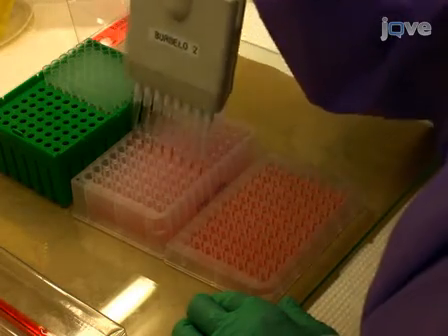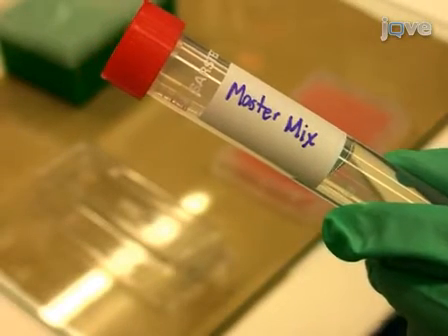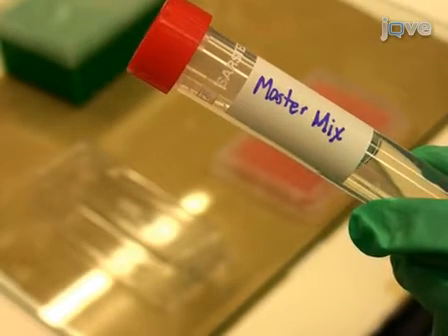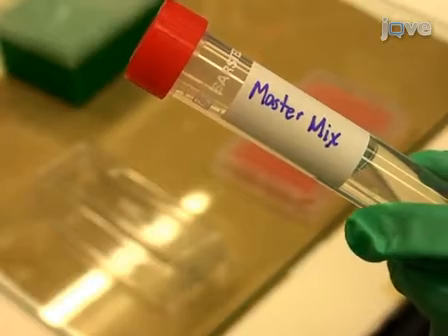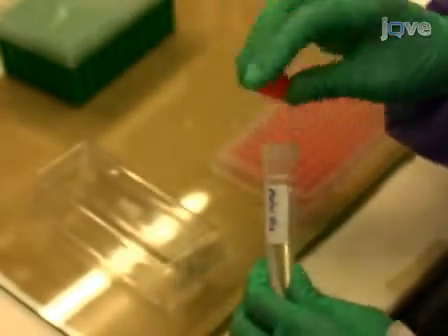After use, seal the master plate with parafilm, replace the lid on the master plate, then cover with saran wrap and store at 4°C. A master mix containing the Ruc antigen extract is next formulated such that 1×10⁷ LU is added in 50 µL of buffer A to each well.